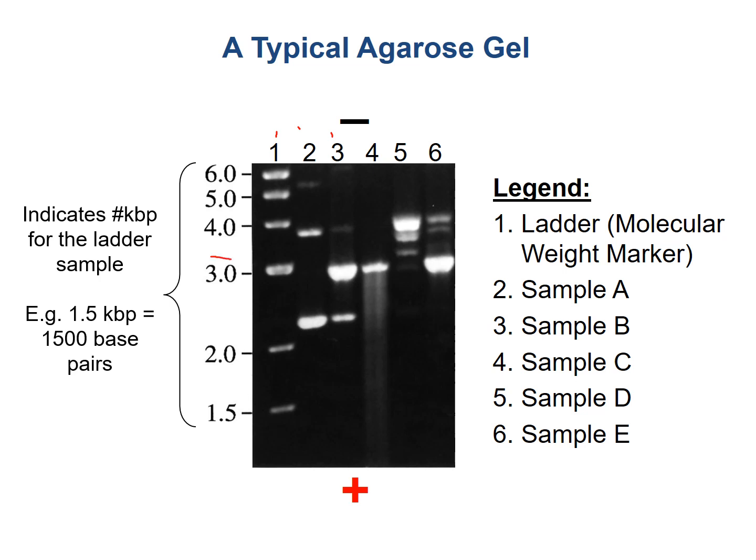Kilo meaning a thousand. So for example, this is three kilobase pairs or 3,000 base pairs in size. You can also see I put a negative and a positive just to show where the charges are. DNA is negatively charged so it runs towards the positive charge on the gel. And all these bands are separated out based on molecular weight.